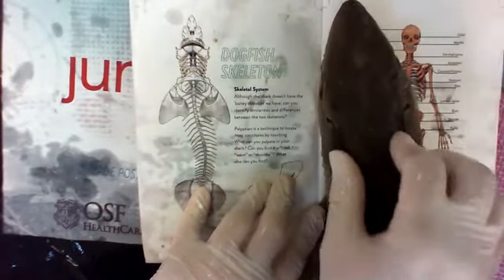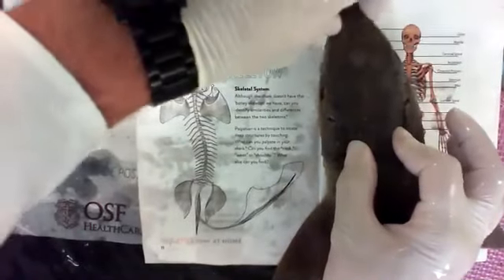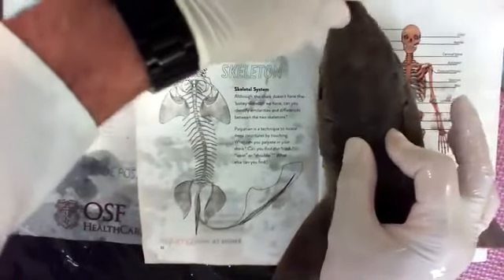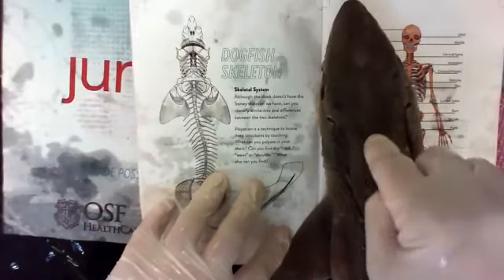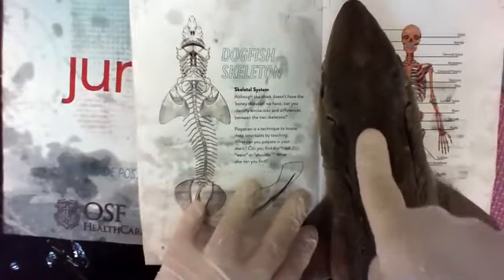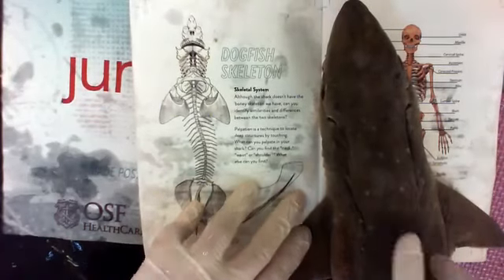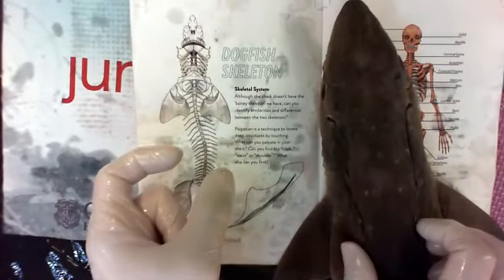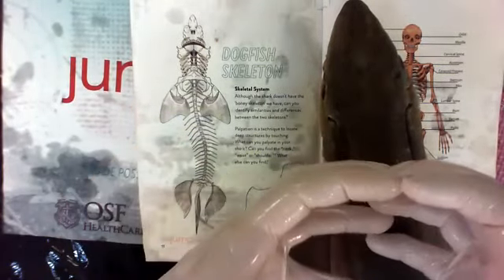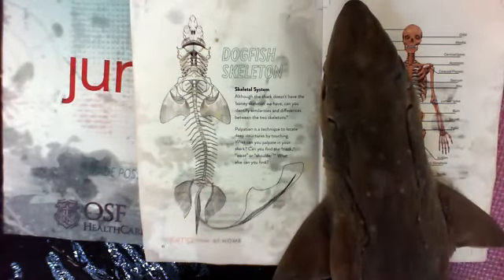So here's the neck. I can feel the muscles in the neck. And I can also tell that's neck because I can wiggle the skull and hold the neck in place, and it doesn't move. If we made a cut across here, you could actually cut the spinal column, the vertebra, and look at the spinal cord. Going down, you can see the vertebra going down, a rib cage. It doesn't go all the way around like ours and wrap. It actually just gives structure or support to the muscle groups that are along here.